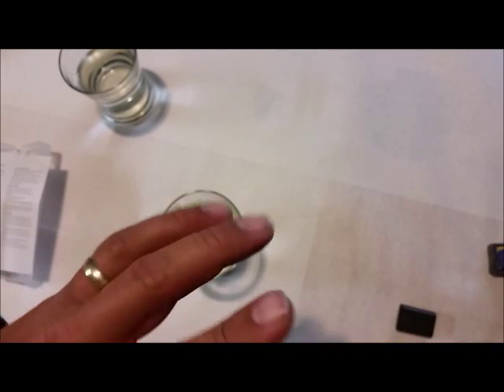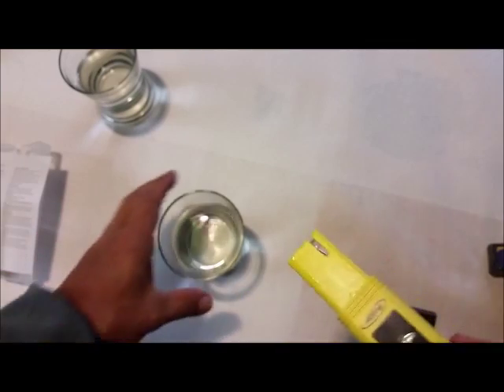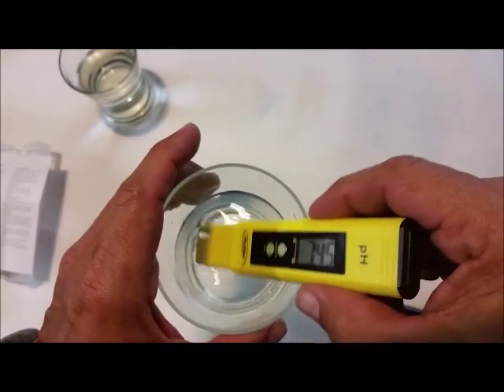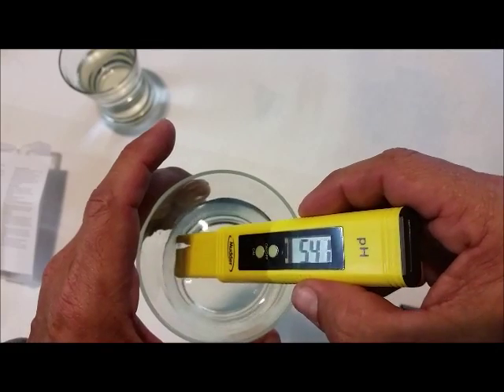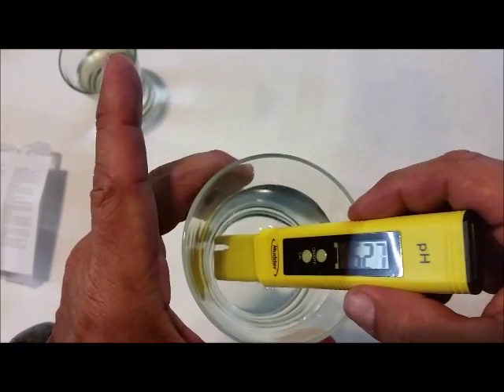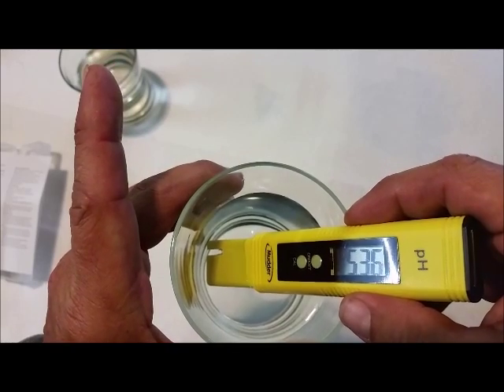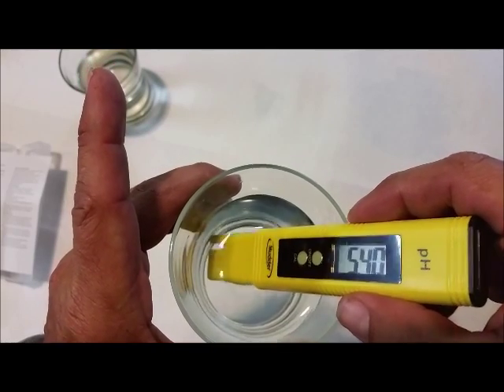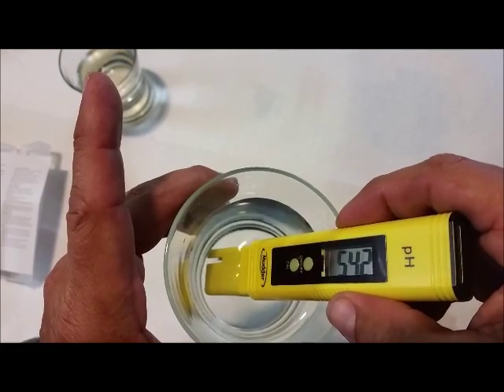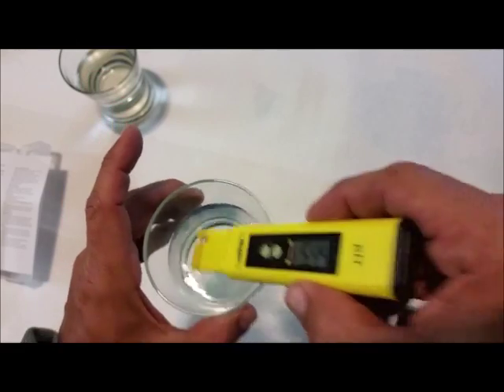Now to prove this, to show the difference, I put two drops of vinegar in this glass just to show you that it will pick it up. It will show the variance, show the difference. See that? Two drops in that glass. It is sensitive enough to pick that up.